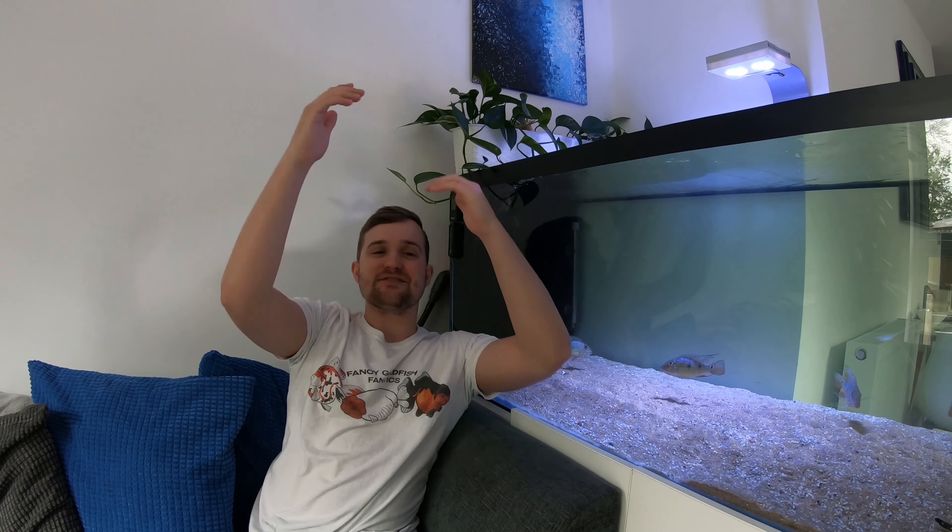What's up guys? Welcome back to Fancy Goldfish Fanatics. Today we're going to be doing some mucus scrapes under the microscope, so make sure you stay tuned to find out more.